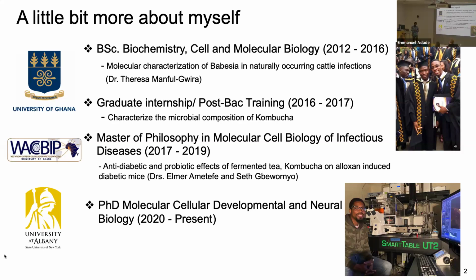So with my microbiome experience, studying how the kombucha changes the gut microbiome, I joined Alex's lab in 2020, right before the pandemic happened. In Alex's lab, we actively study microbiome spatial organization, how microbes interact in their complex environment, using imaging techniques. Most of the work that I'll show you today is deeply rooted in imaging and developing new imaging algorithms that can help us to dissect this microbiome information.